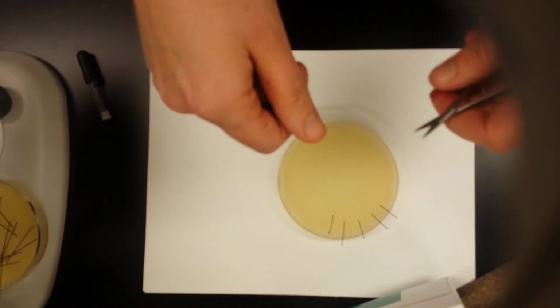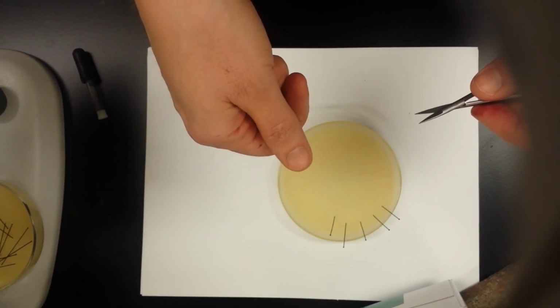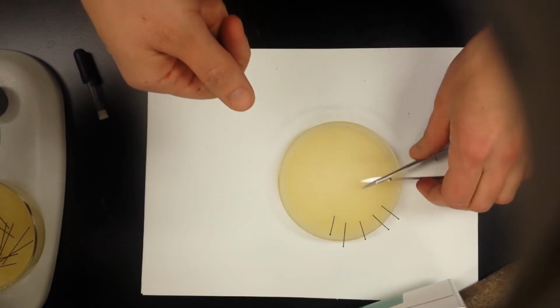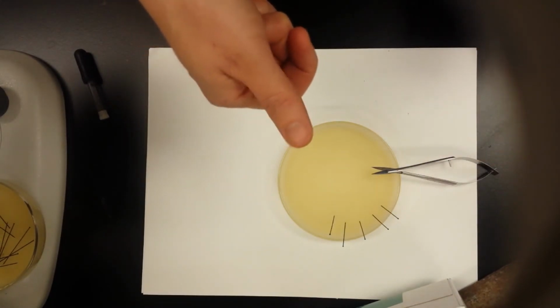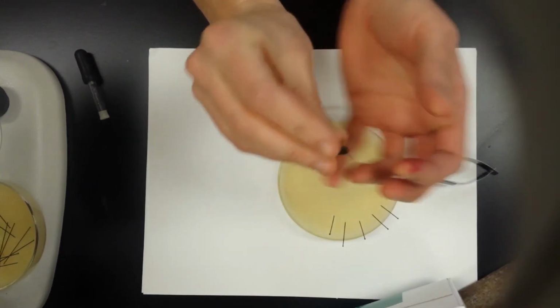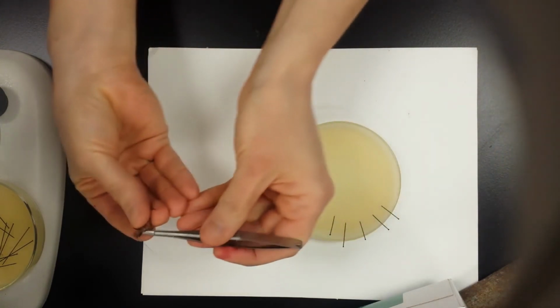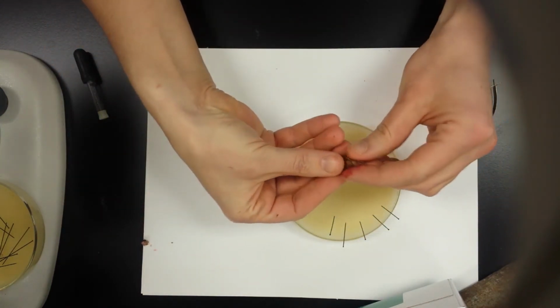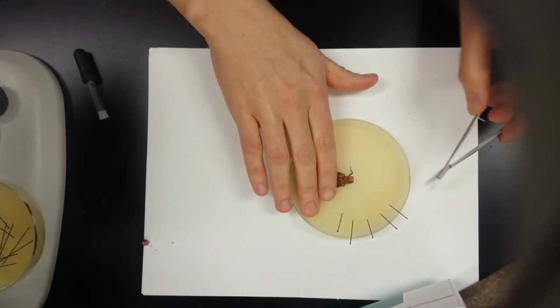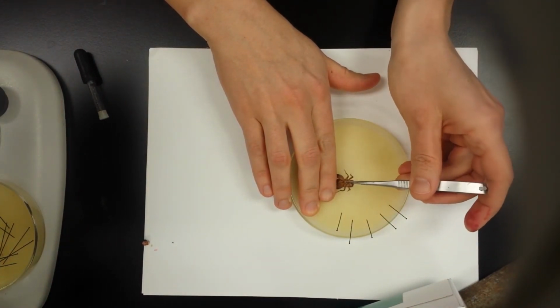Okay, for this next step, first I have to give you a warning. This is a little bit gruesome. What I'm going to be doing is very quickly euthanizing this cricket by decapitating it, and then I'm going to show you how to prepare the dissection of this cricket so that we can examine its Malpighian tubules. So here I've got the cricket. I'm going to very quickly euthanize her by decapitating her with these iris scissors. Okay, and then I'm going to position her in this dissecting tray, and I'm just going to make a single cut along the ventral surface here.